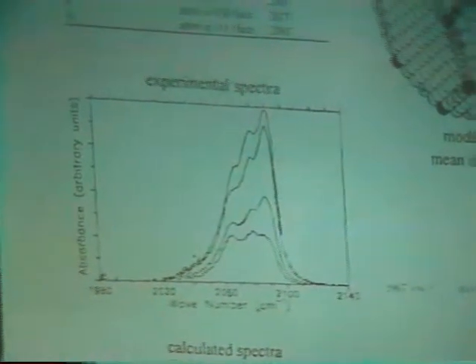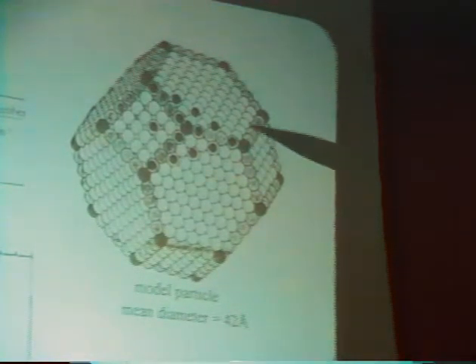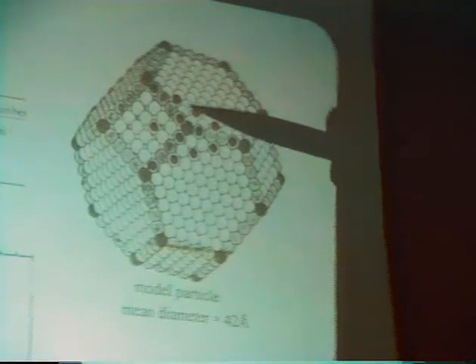If we look at the case where we have 13 molecules placed on here, and what we did was start putting them around a corner and expanded them out into the faces. And 13 molecules here is our placement, which is represented down here. This is going to be the model spectrum, the spectrum that we're going to deduce from this.